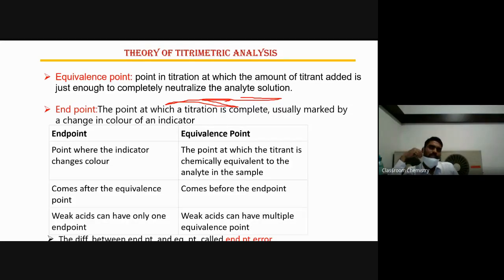If you carry out the titration of NaOH and HCl using phenolphthalein indicator, or if you carry out the experiment of chemical kinetics in the physical chemistry laboratory, at some point you reach the point where, after placing one drop of titrant, the conical flask shows pink color. But before this addition of one drop from the burette of known concentration, that is the titrant, the solution is colorless.